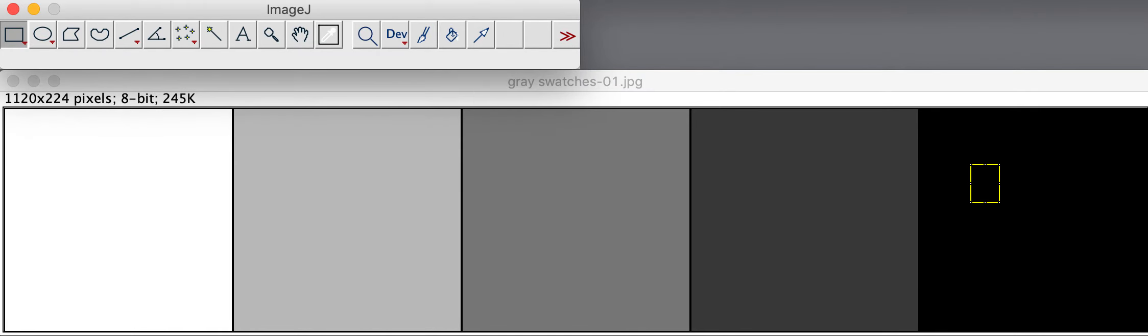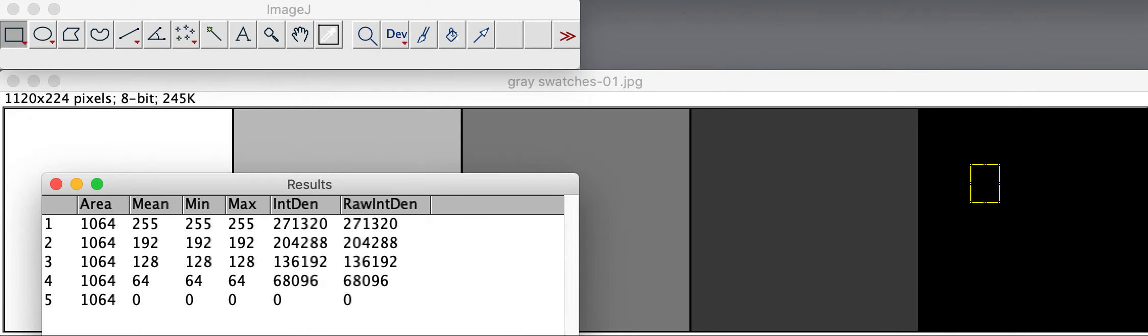And now we have a results window that contains the integrated density values of, in this case, what was white, light gray, medium gray, dark gray, and black.